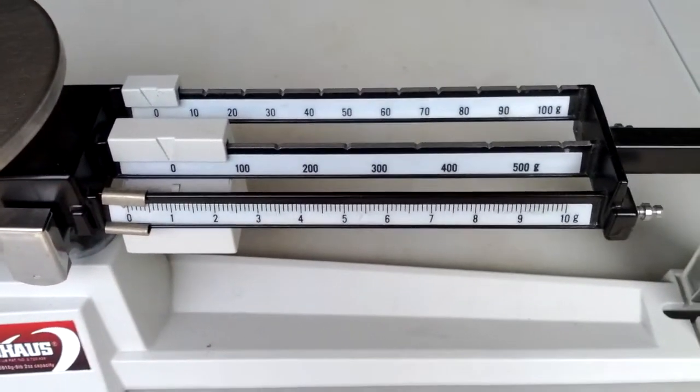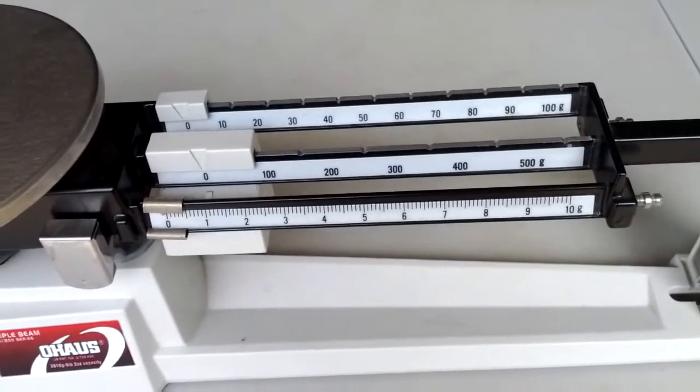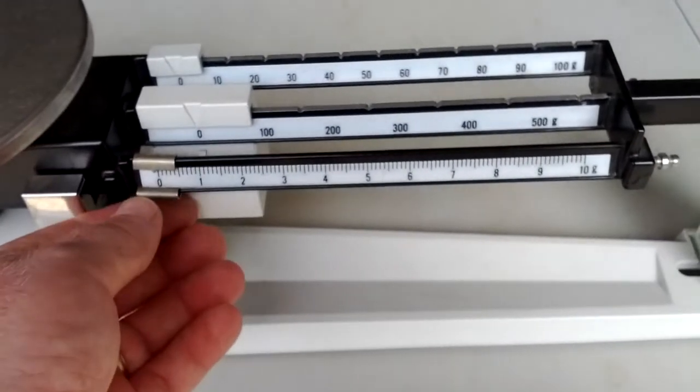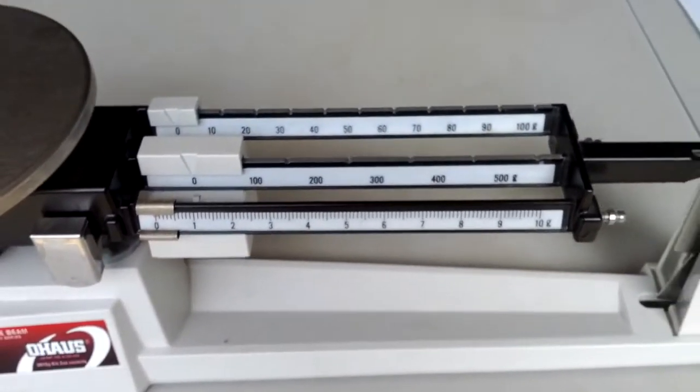And then the back one is in tens. And again, it's got little grooves. You have to make sure it's right on one of the numbers in the groove. These are called riders, not sliders, even though they slide, because they ride along the beams.